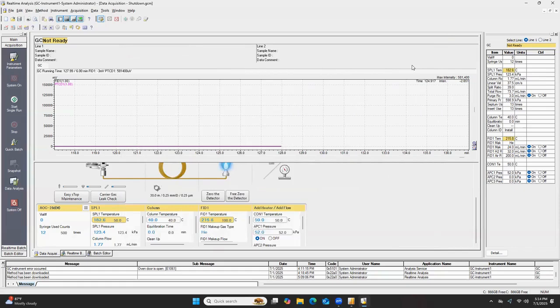Everything's going good so far. Yeah, like I said, just get this overlock.